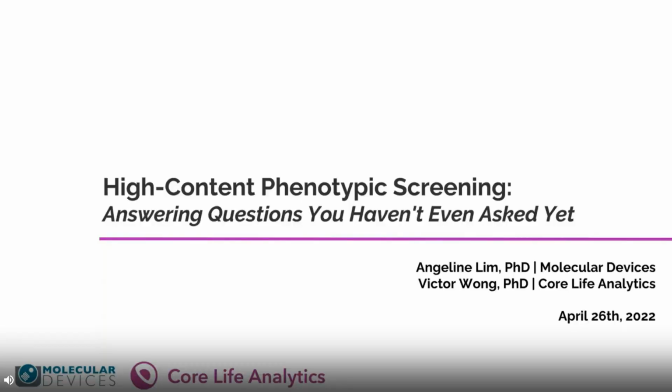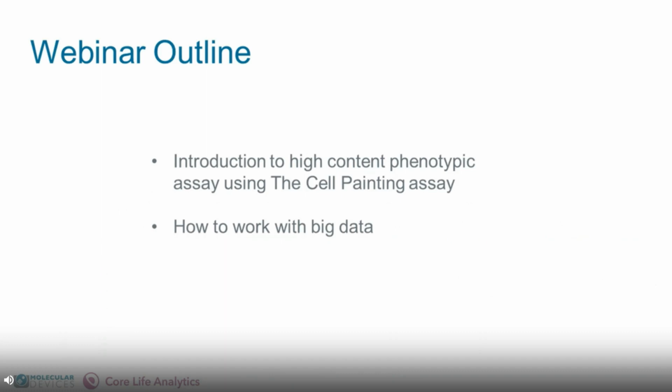Thank you, Angeline, for the lovely talk covering high-content phenotypic screening using Cell Painting approaches. And for my part now, I'll continue with that story to cover the questions that you've not considered or perhaps even been afraid to ask. More specifically, I will address the issue of how to work with big data. This talk is to emphasize how to turn Angeline's wonderful images of cells into biologically meaningful information.